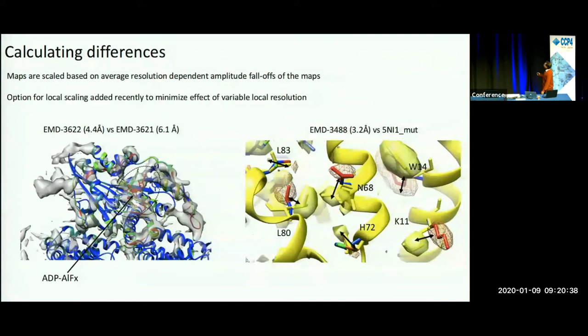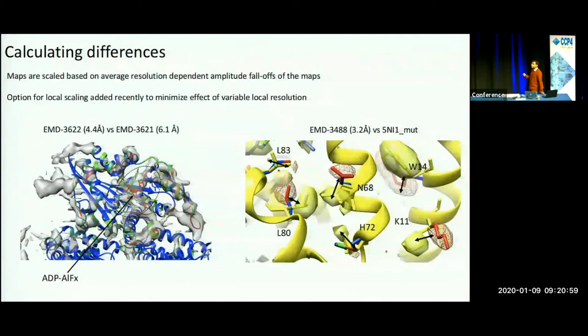We can also use difference maps to compare model against maps, essentially as a method to validate model fits. This is done classically in crystallography to calculate difference maps and identify and fix models based on the differences — we can do similar things for EM. The arrows shown are manually introduced errors; some are really subtle changes in side chain conformation, some are quite obvious differences, and the difference map calculation identifies these.